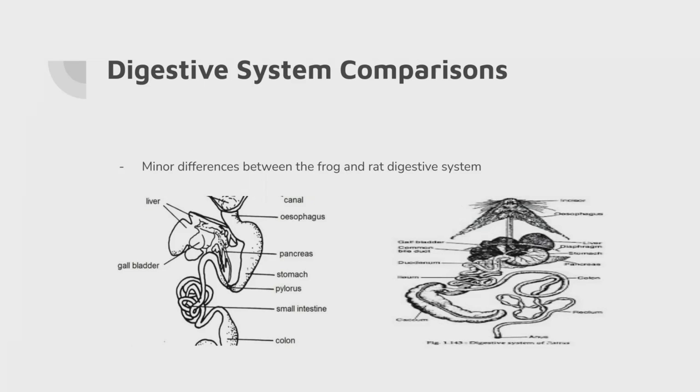They both serve as sites for adding enzymes and breaking down the food in order for the food to be completely digested. For the intestines, except for the comparison of sizes between the two, with the rat's intestines being much larger, they serve as the main organs of digestion.